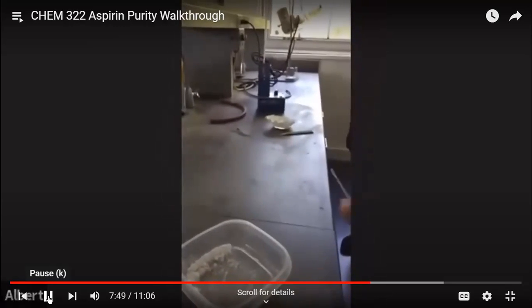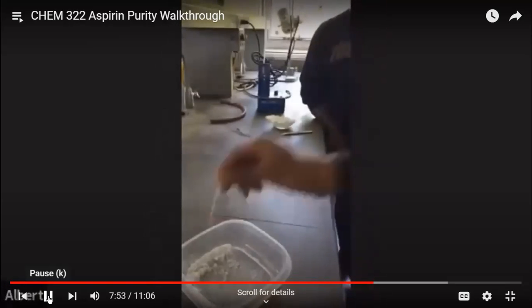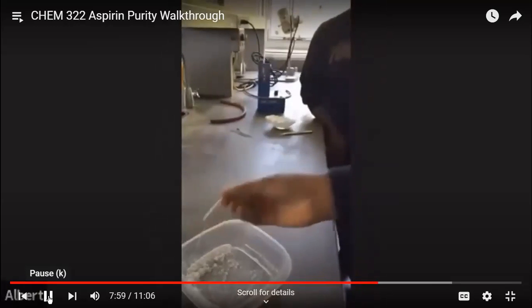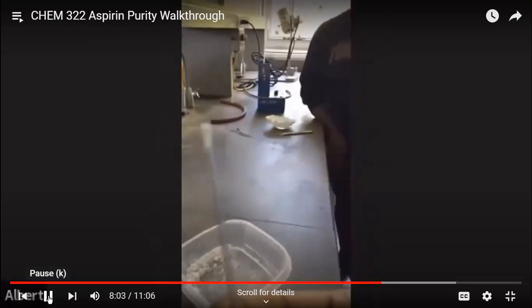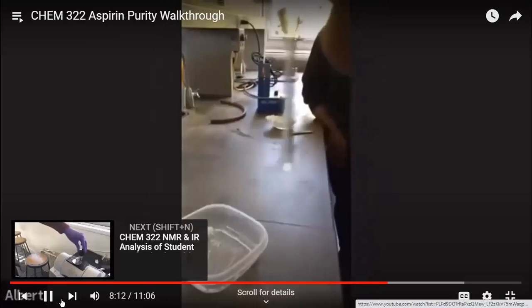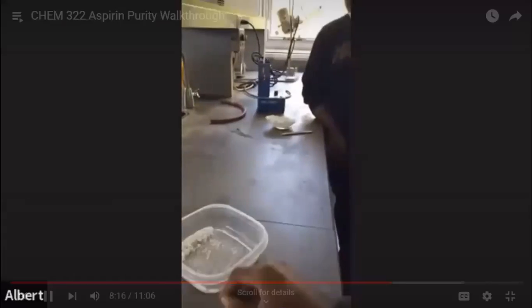All right, so that's my crude aspirin. I'm going to take my capillary and dip it in here on the open end, not the closed end. I'm just going to dip it in, and you can see I got aspirin in the tip. Can y'all see that at home? Just tap it on the bench top, just like that. You just keep tapping it until you can see a little bit of the aspirin has gone down, but not all of it. Keep tapping until you get it to the bottom.